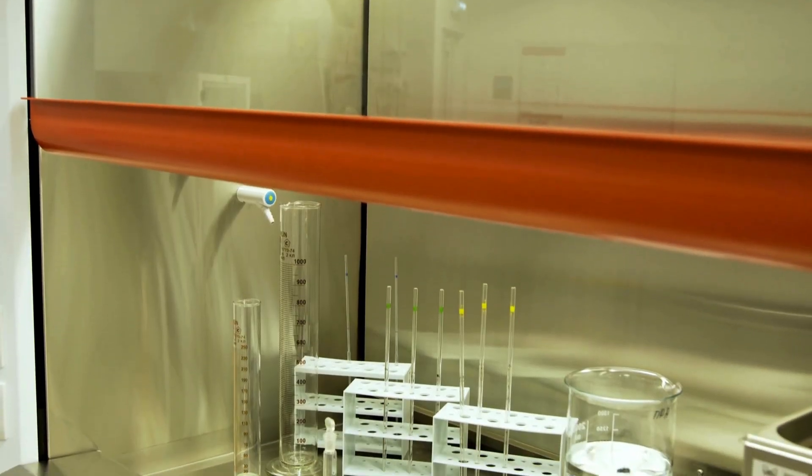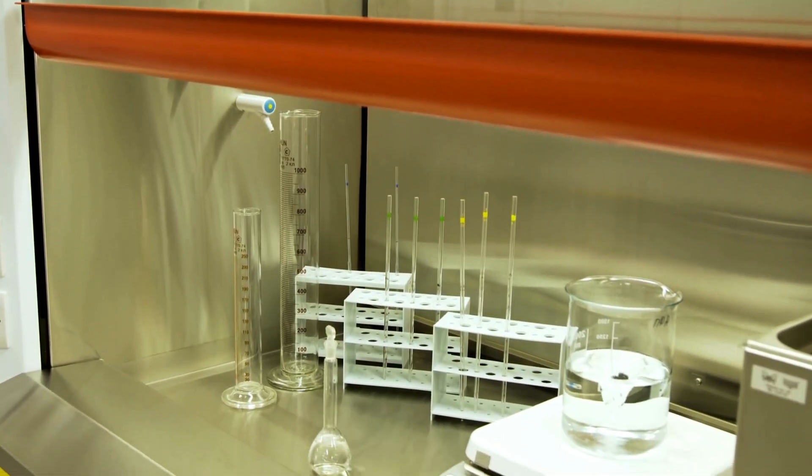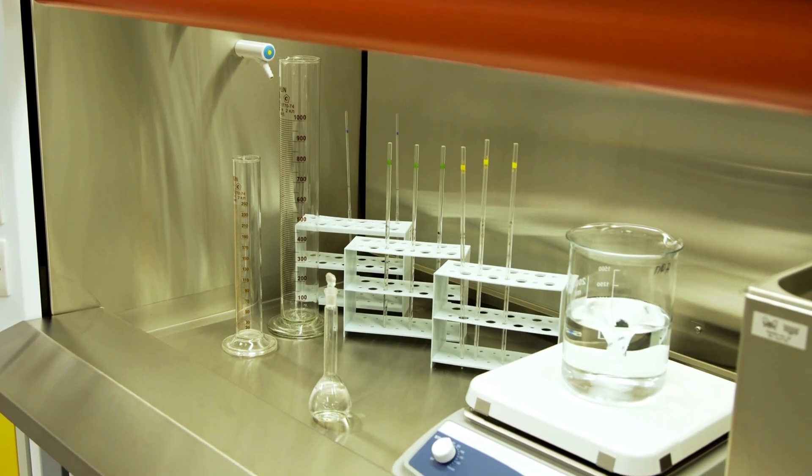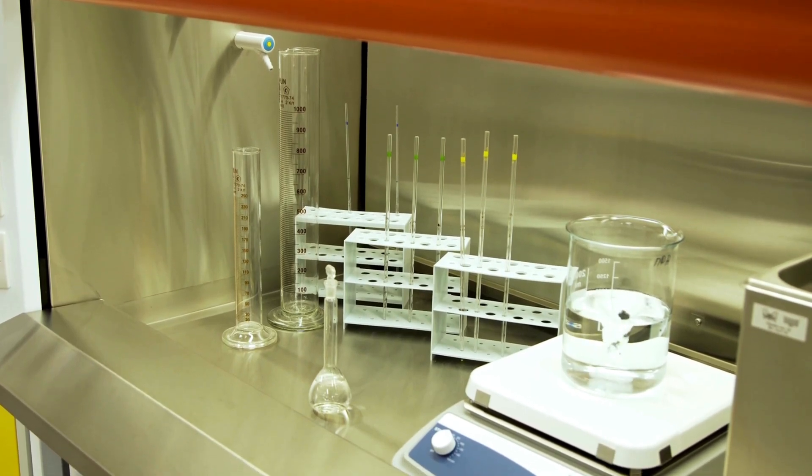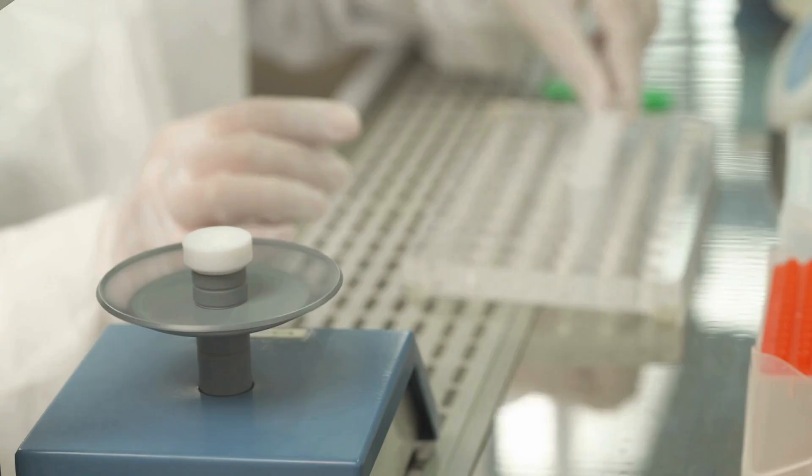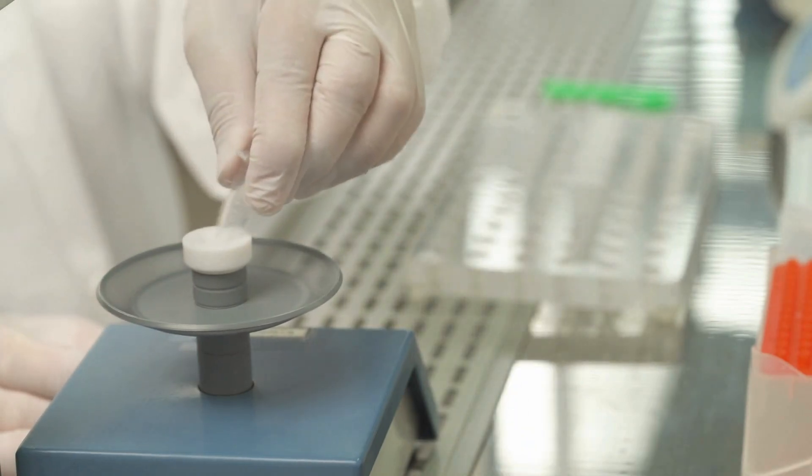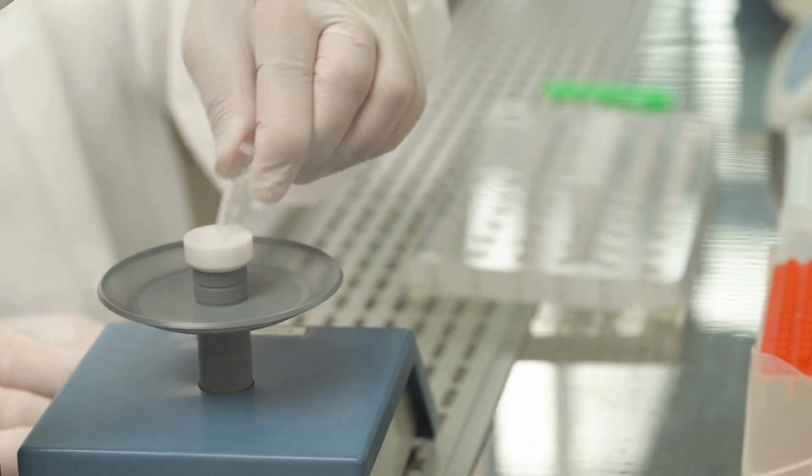Safety tips and pro advice. Before you go full breaking bad, remember, always use glass or ceramic containers no metal. Match the stir bar size to your container. Start slow to avoid splashing. Clean the stir bar ASAP to prevent gunk buildup.